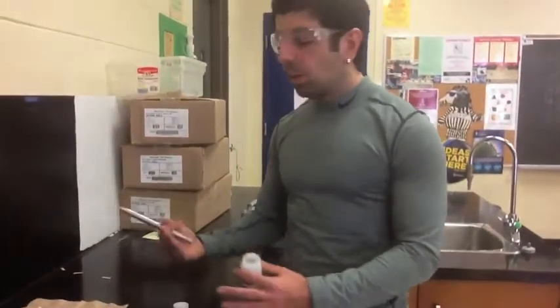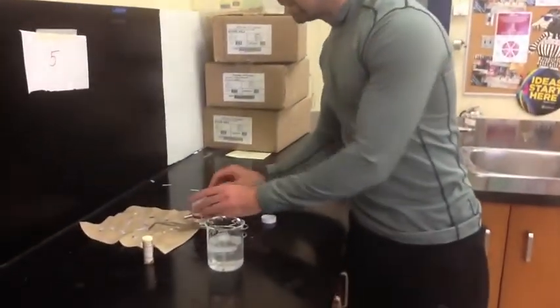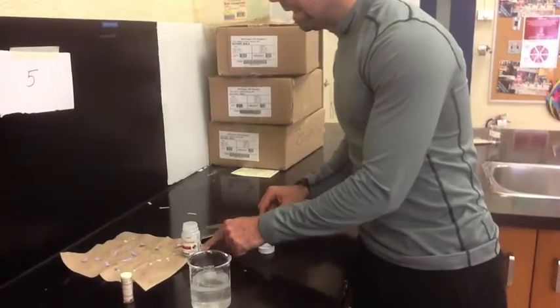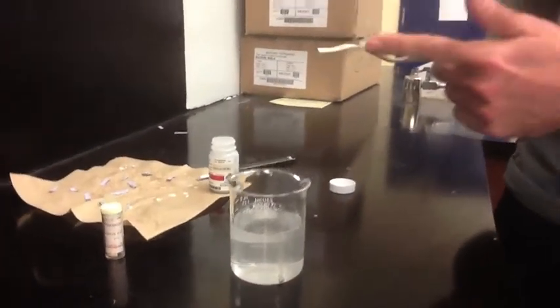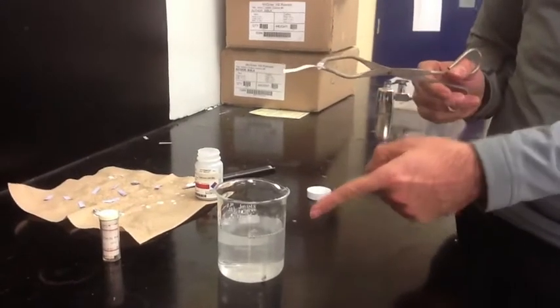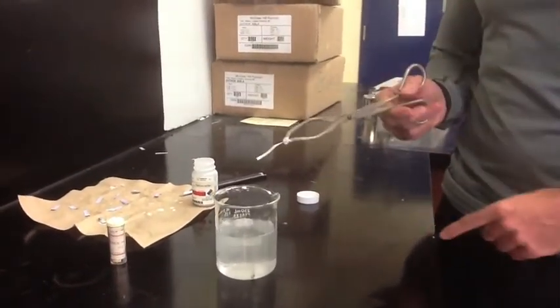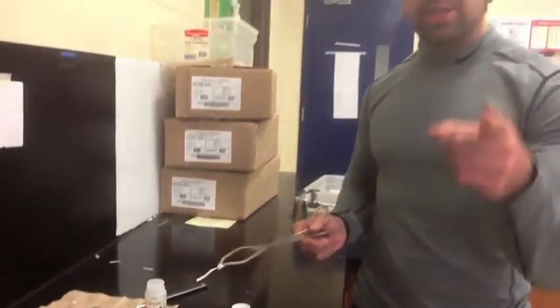So you're going to tell me what is the gas that is being given off. And secondly, once you've identified the type of reaction and written out a balanced chemical equation, you are going to take a piece of red litmus paper, dip it in here, and observe. Will the red litmus paper stay red, which means we are forming an acid, but if this red litmus paper turns blue, we actually will have a base. I'm not going to do it, you're going to do it, so good luck with your results.